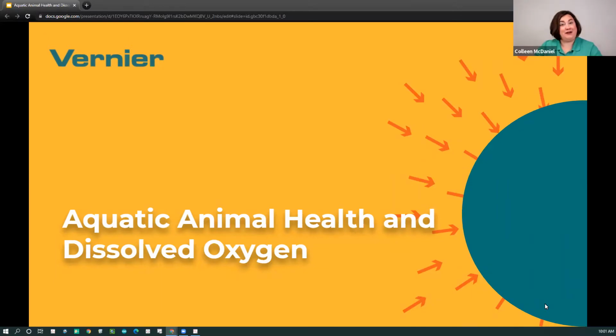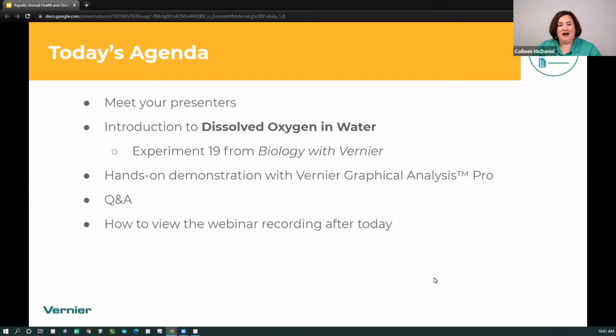Good morning or afternoon to everybody, depending on what time zone you are in. Just to go over today's agenda, we're going to give a brief introduction of myself and John, and an introduction to dissolved oxygen in water, where we're specifically doing an experiment from one of our books, Biology with Vernier, experiment number 19.